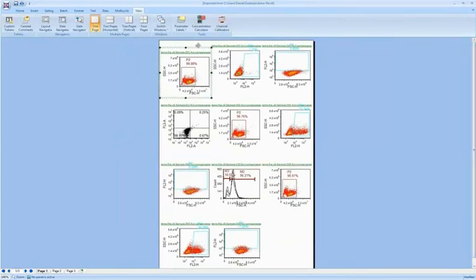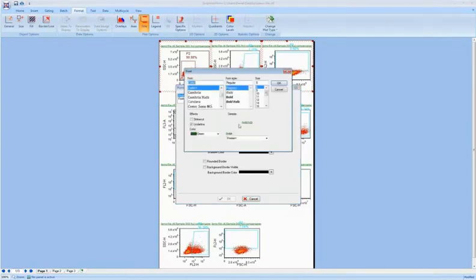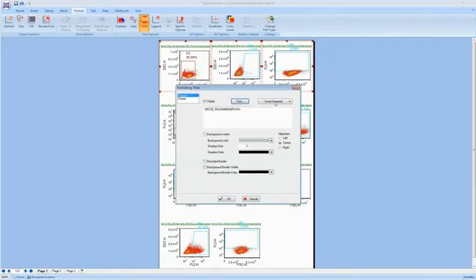Now, some of you may notice as I'm looking at these plots that if you've used FCS Express before, the defaults are a little bit different. The titles here are in green and don't have the border. I played around with the titles a little bit in the preferences so that they would take up less room. Changing any options on the titles in FCS Express is very easy. I can select many plots at the same time, go to Title, and if I want my font to be maroon, I can do that.